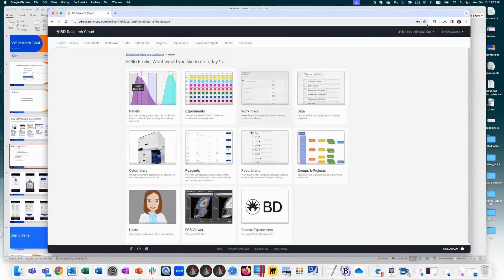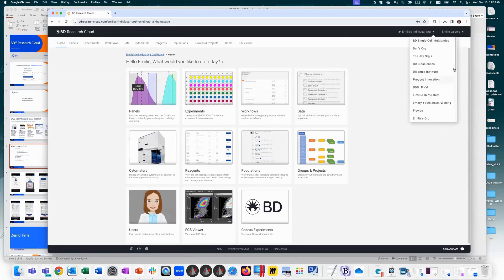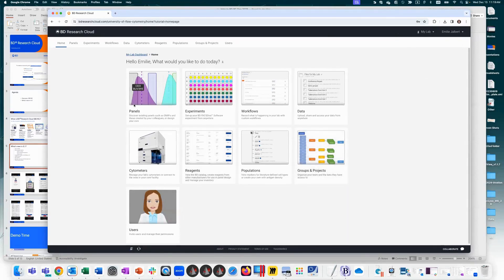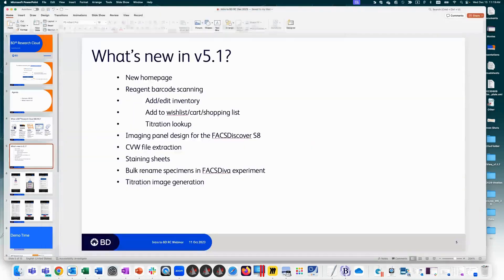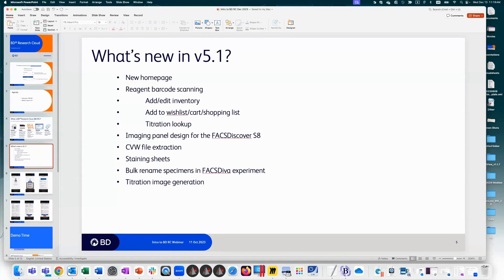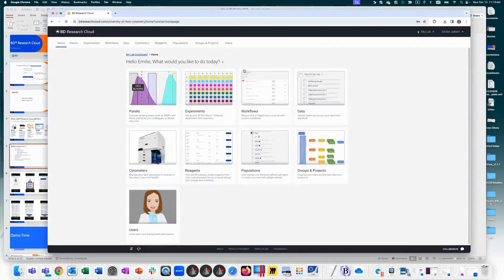Now that you've seen the overview, we're jumping into the new features. We went through the new homepage — now let's look at reagent barcode scanning, which is in the reagents section.